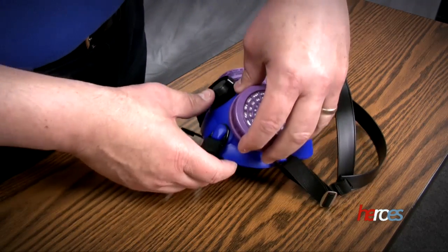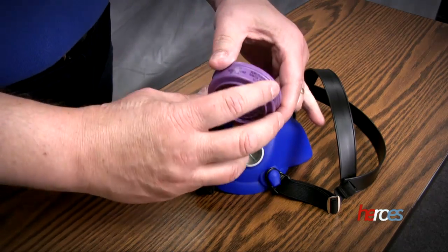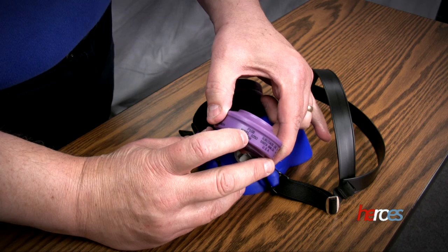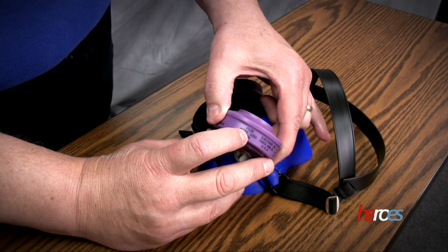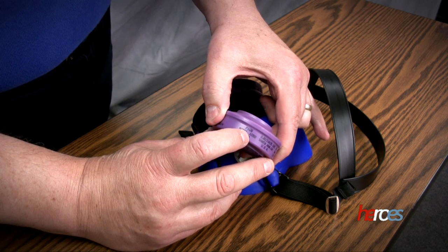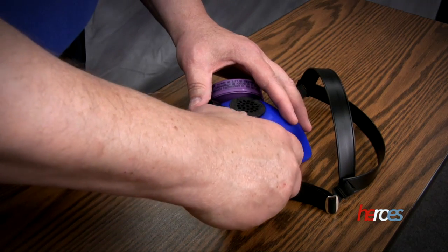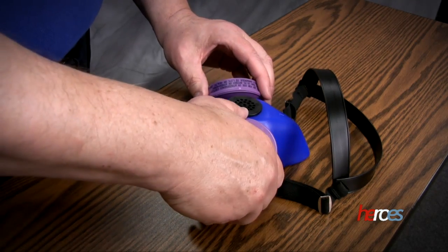Make sure that the filters are appropriate for what you want to use them for. This is a P100 filter, which is good for hardwood dust and other particles, but it will not be appropriate for use with chemicals and vapors because it will allow those to pass right through. If you need cartridges for those types of hazards, make sure you consult with the safety officer or your supervisor.